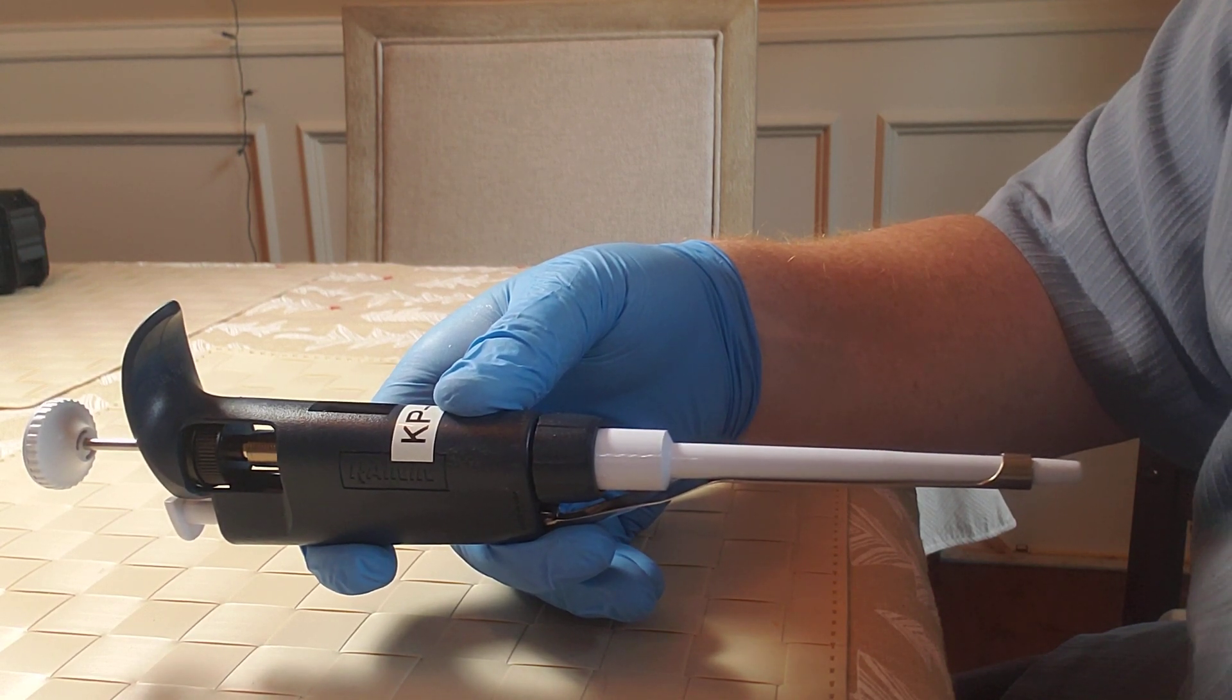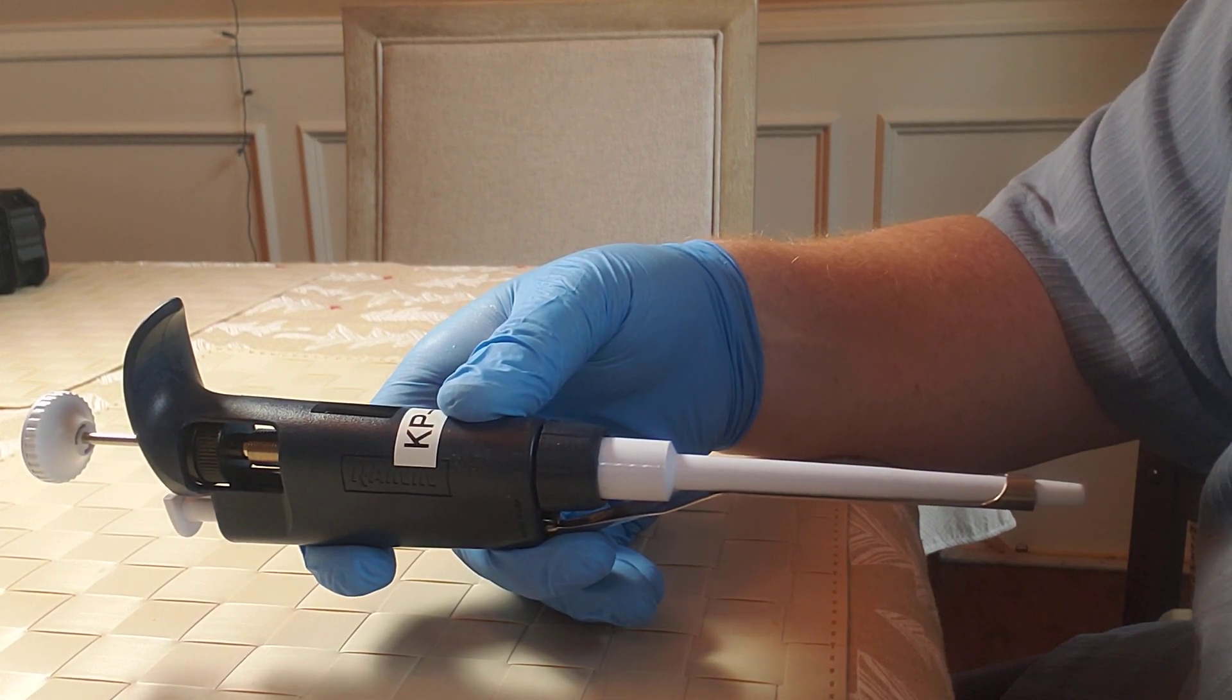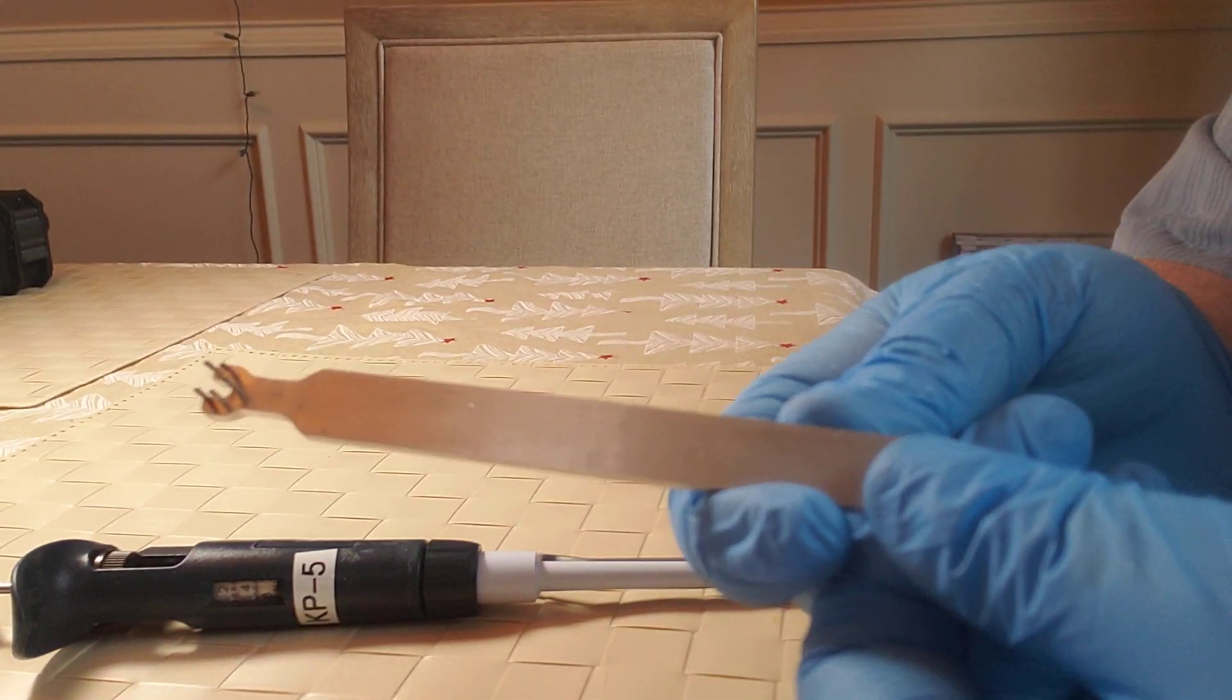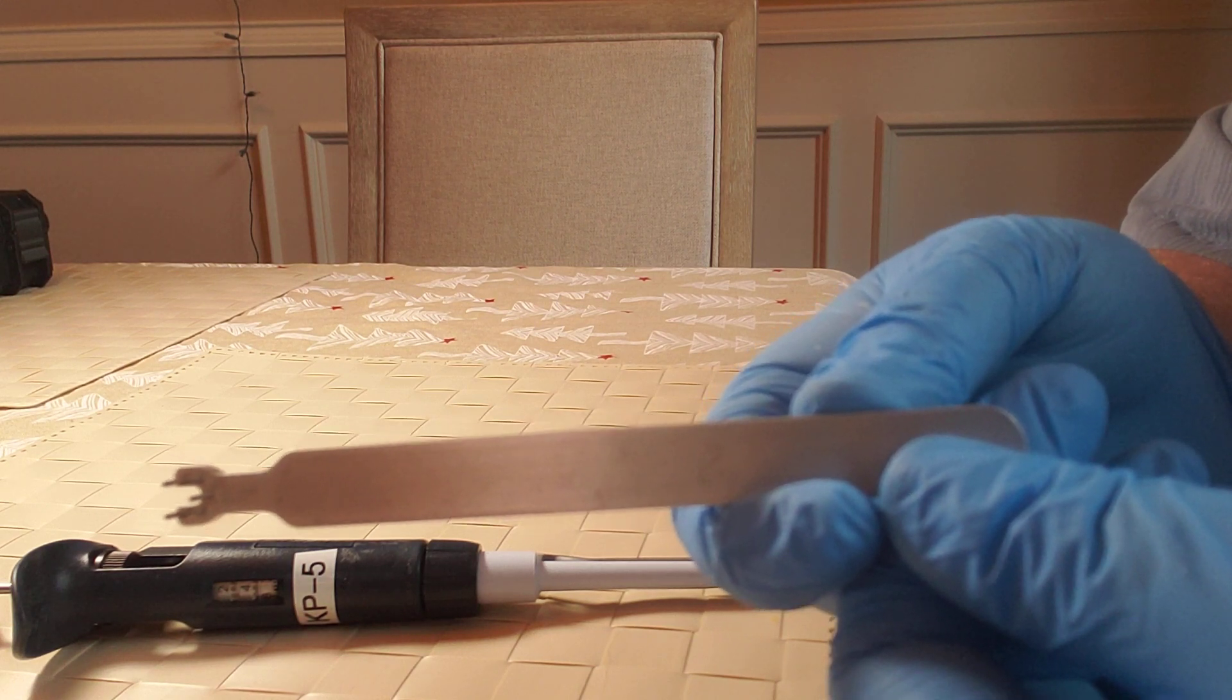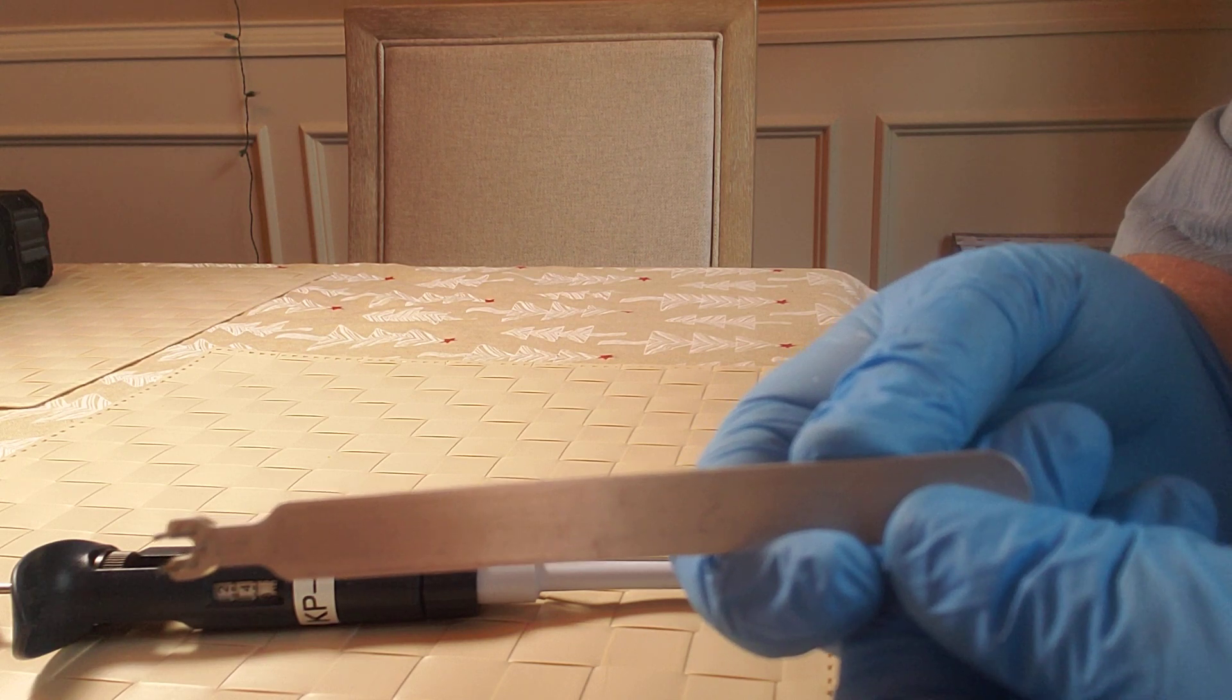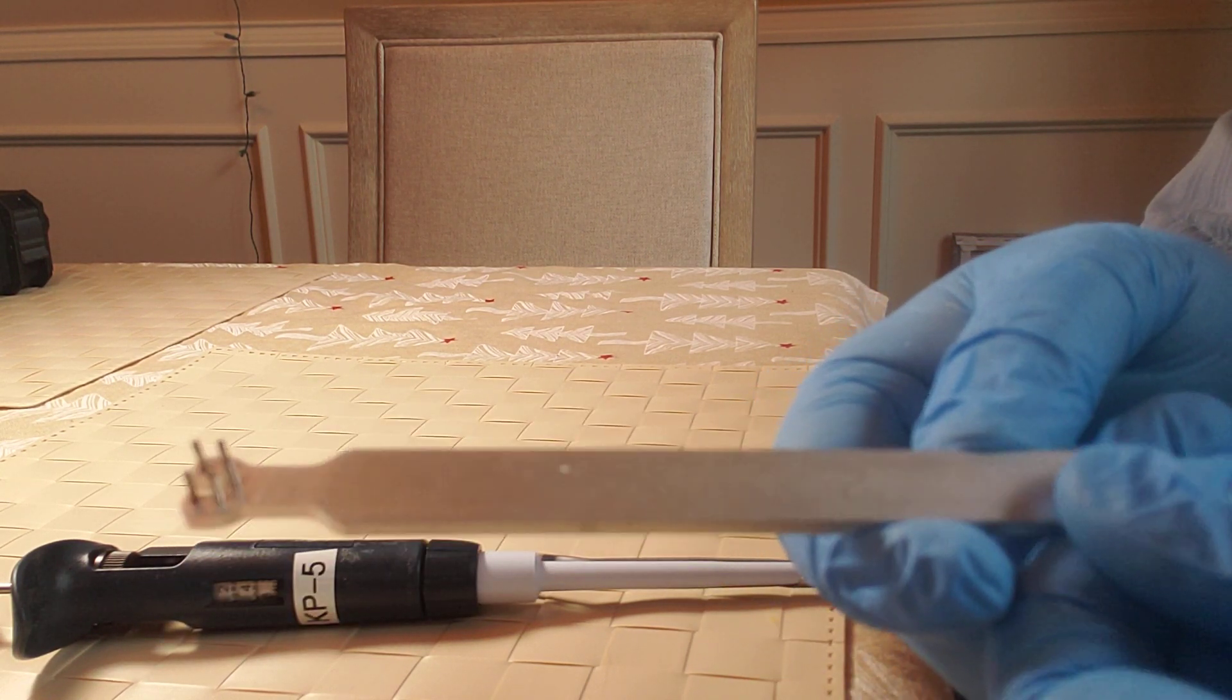Section 2: How to perform the calibration adjustment process. As you can see on this screen here, we have the Rainin Classic, the Gilson Pipette Man Classic, the Pipette Man G, and the Pipette Man Neo, and of course, the Rainin Classic calibration tool.